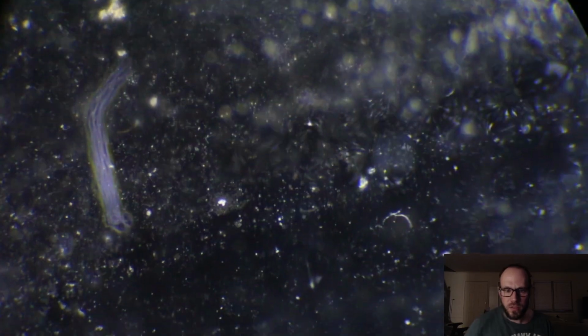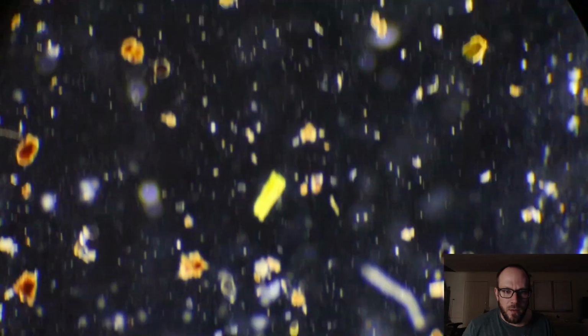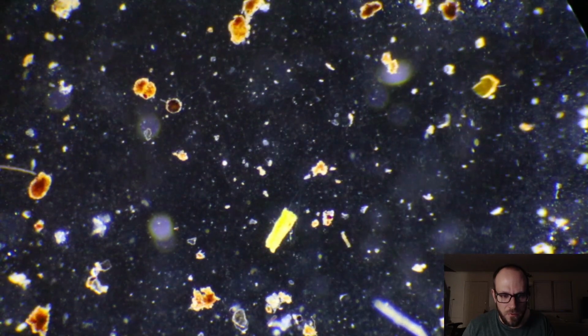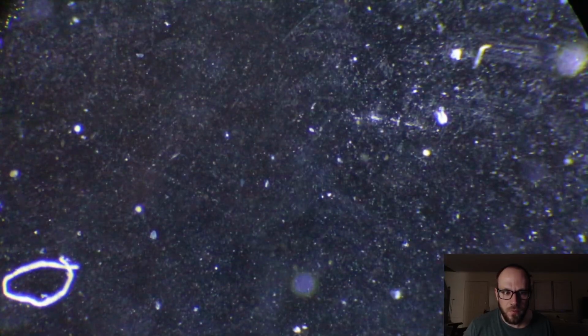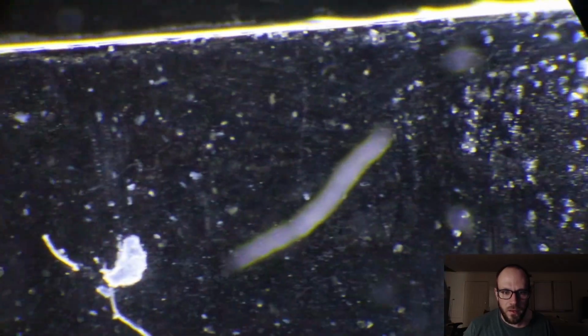Welcome back. I switched to one last slide for tonight. This is dry, that's wet. So, I preserved this slide, but I don't think anything on it survived, because I'm not perceiving any sort of movement. There's a lot of sediment and stuff in here. Piece of string. But nothing is moving. I don't think I need to preserve this one anymore. Sadly, it's dead, Jim.